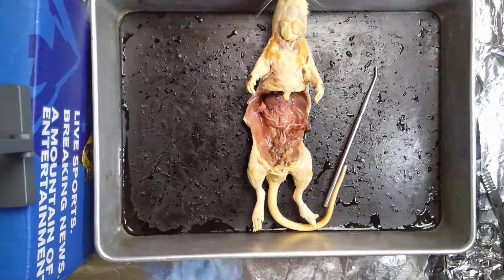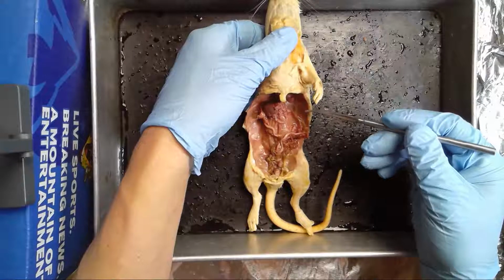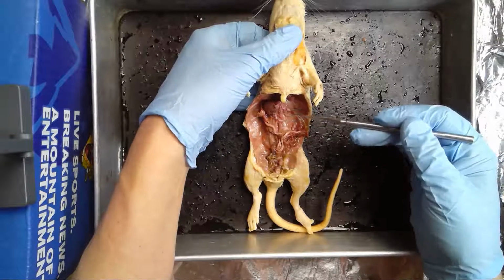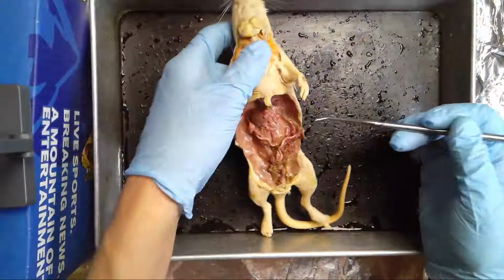In this video, we're going to look at the female reproductive organs of a rat. In sequence, we've opened up the abdomen, removed many of the abdominal organs. As a quick note, we're going to take a look at the kidney first, actually.